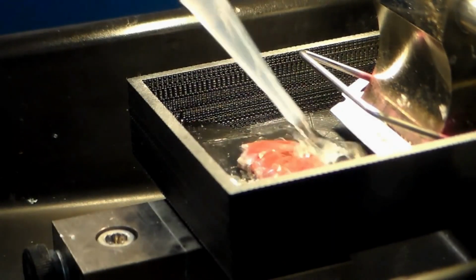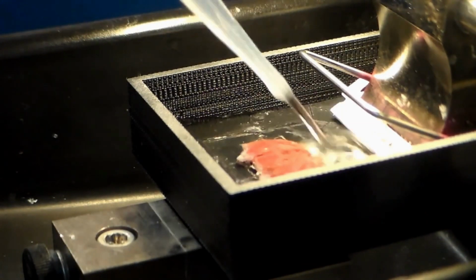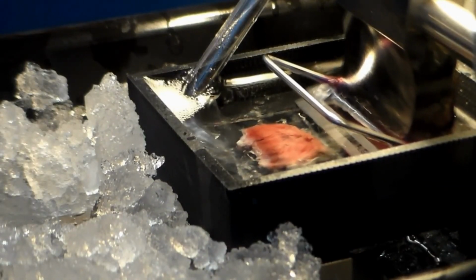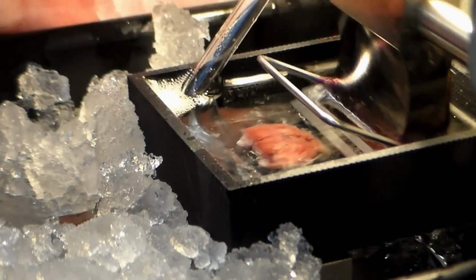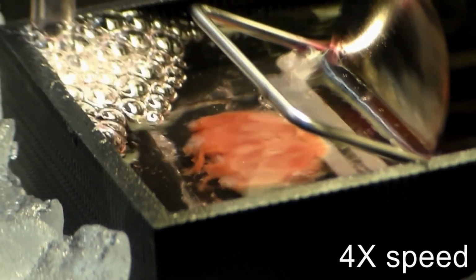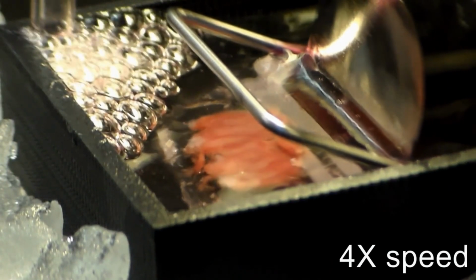You'll see us skip ahead here in just a minute, and what's happening is we will put ice around the entire chamber to make sure that the relaxing solution stays cool, and we will also bubble the relaxing solution with oxygen to make sure that the solution around the myocardium stays oxygenated, and therefore the slice is more viable.